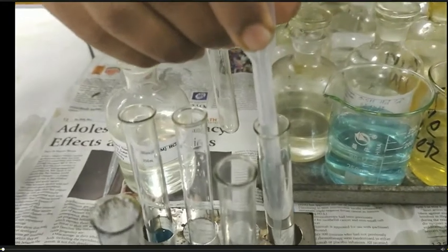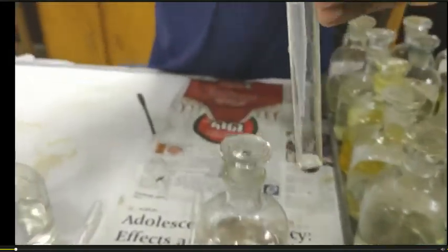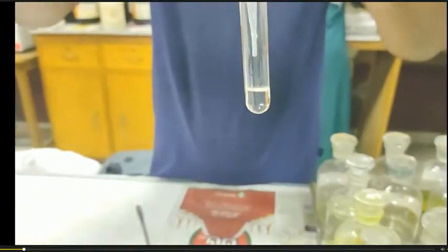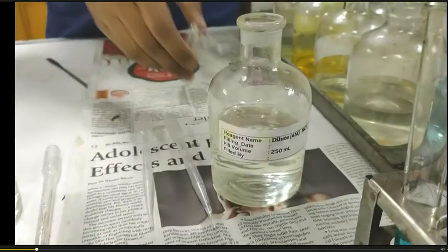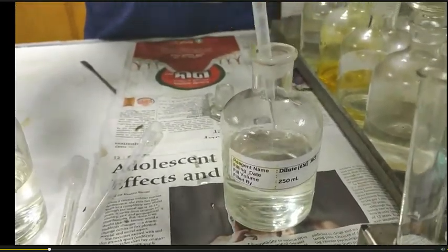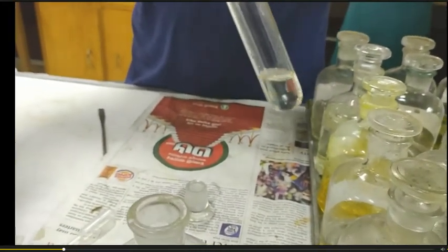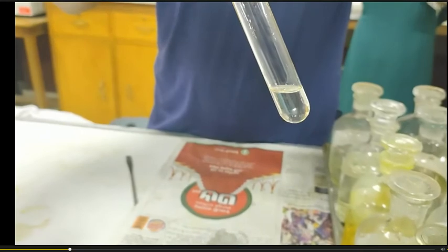We are taking the sample solution in the test tube. Into this sample solution, we would add 6 molar dilute hydrochloric acid. If PPT appears, then it would be indicative of the presence of group 1 cation. If PPT does not appear, then it may be group 2, 3, 4 or 5.